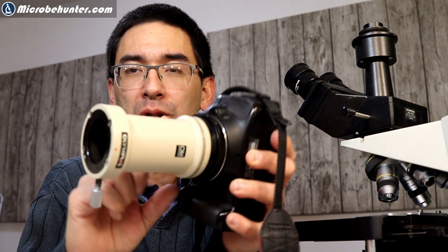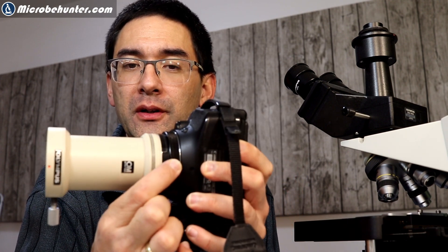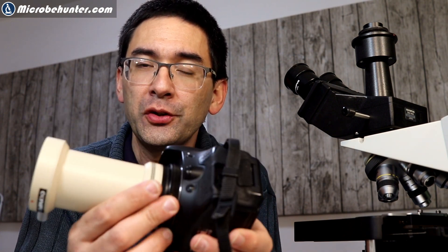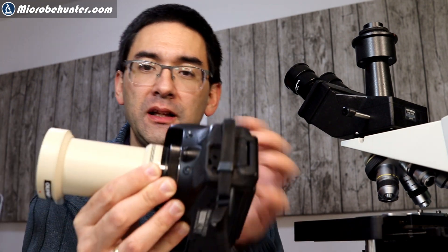Specifically there was a question about connecting a DSLR camera to an adapter, and it's about the fact that most adapters are sold for Canon or for Nikon — but what happens if you have a Sony camera?